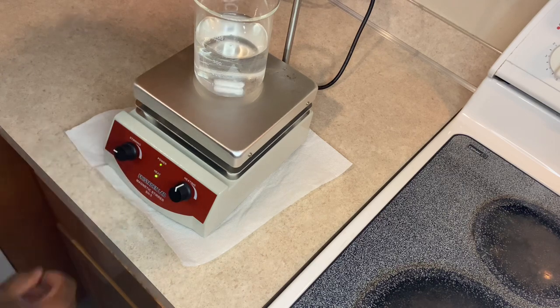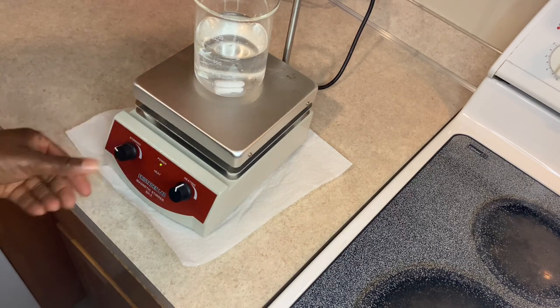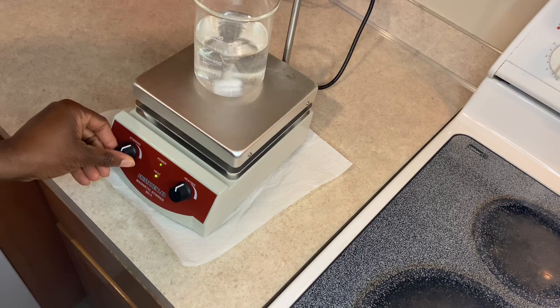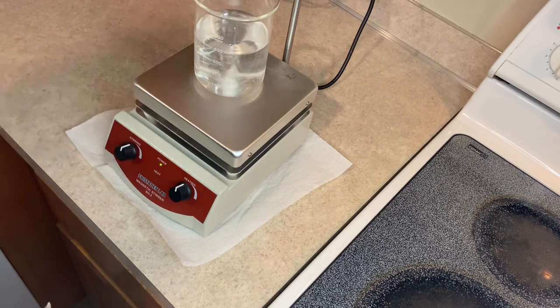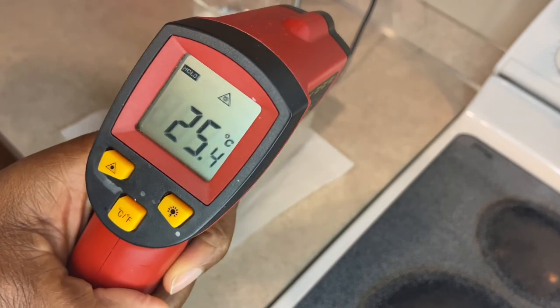You can go slow or fast. I've stopped it right now — it's stopped, and I can start it again. Let's check the temperature. It's now at 25 degrees Celsius.